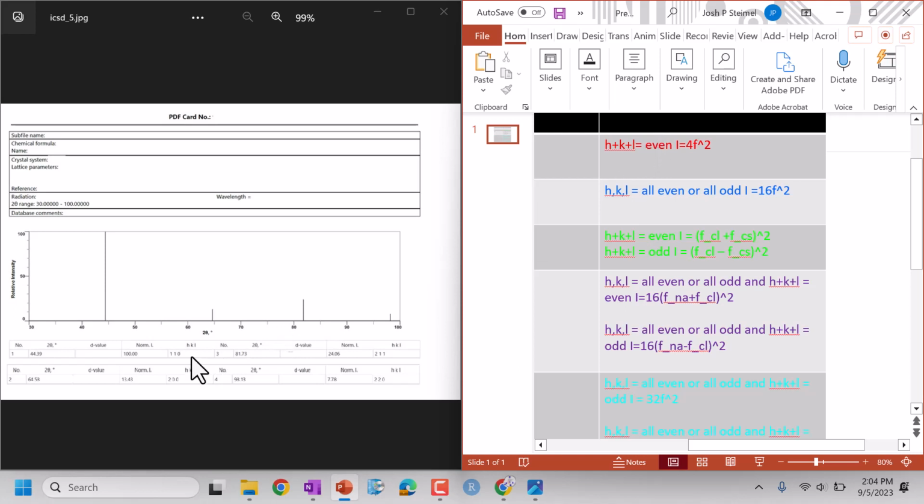So let's look. I've got 1 plus 1 plus 0 is 2. That's even. 2, good. 4, and 4 here. So this is looking promising, just like we did last time. But let's compare. Okay, so BCC is a candidate. It matches what we're looking for.